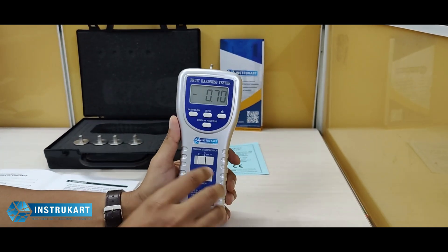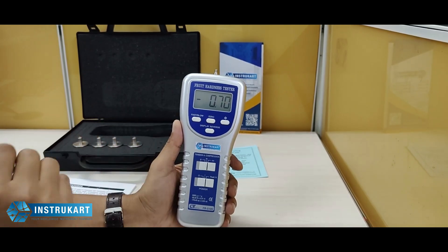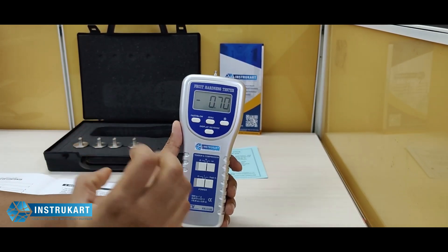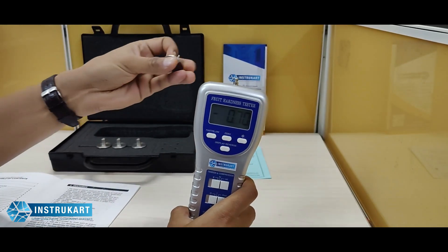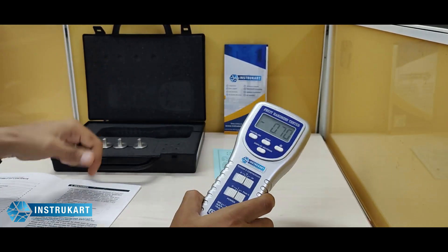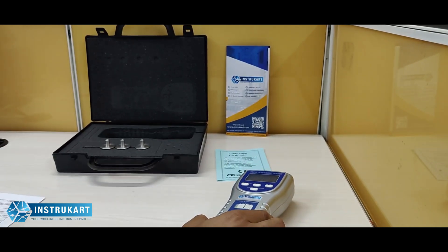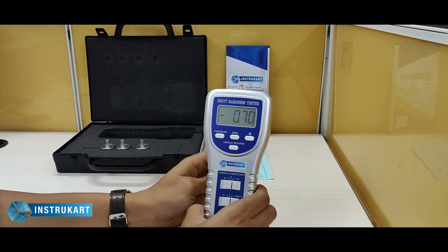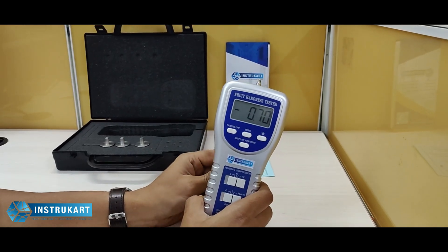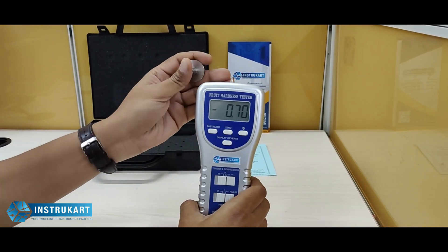This fruit hardness tester basically helps assess the ripening quality of the fruit and also determines the hardness with the help of the dynamometer principle. It works on the principle where the force applied or the pressure of the dynamometer is divided by the area of the pressure, and that is how we get the hardness value of the fruit.